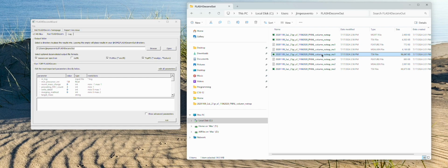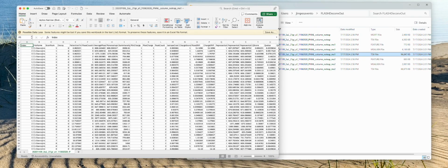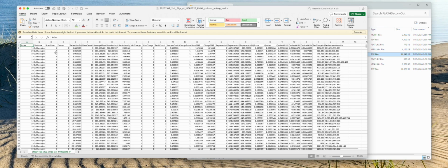be here. And when it opens up, okay. So this file has quite a bit more information, but it has inherently the same components as the MS Align. It has scan IDs, precursor masses, charges, and things of all that sort that you can sort through.